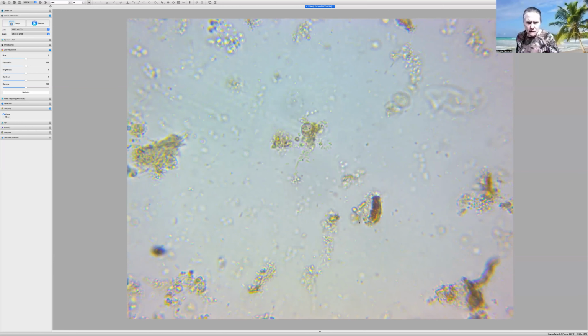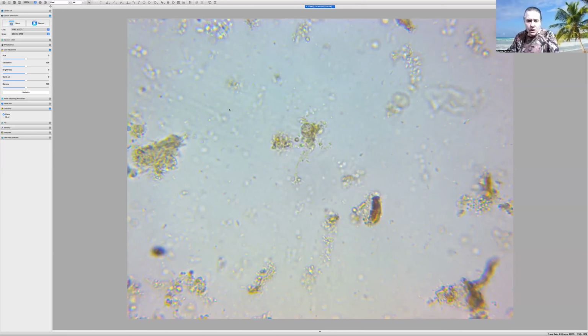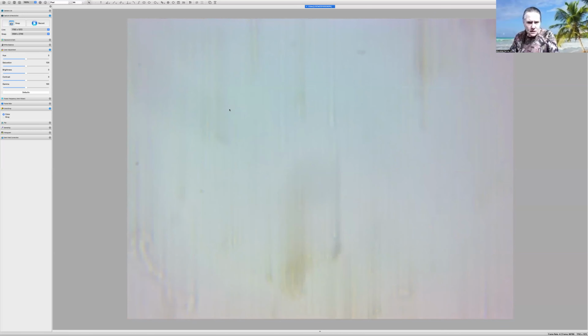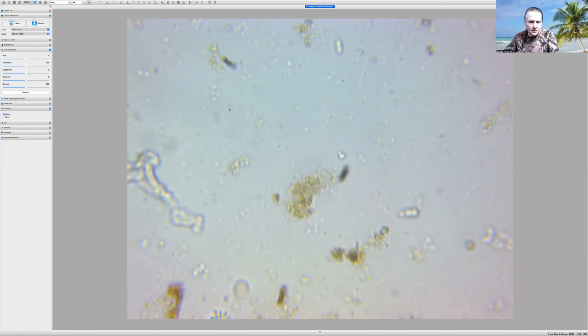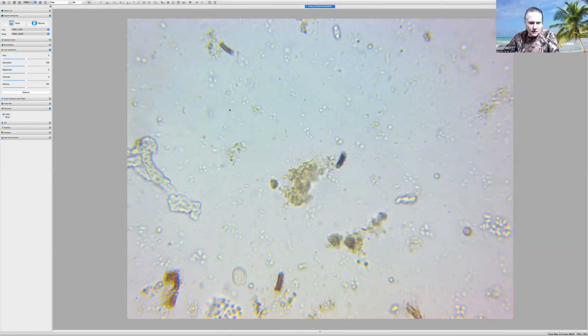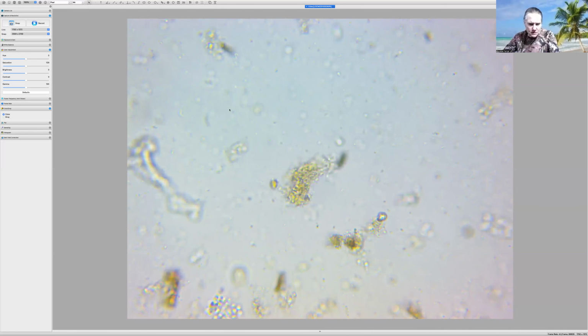And you just have to look for streptobacillas, and there's just so many of them that you point out, different sizes, different strains, things like that. So you've gotten to see the nematodes.